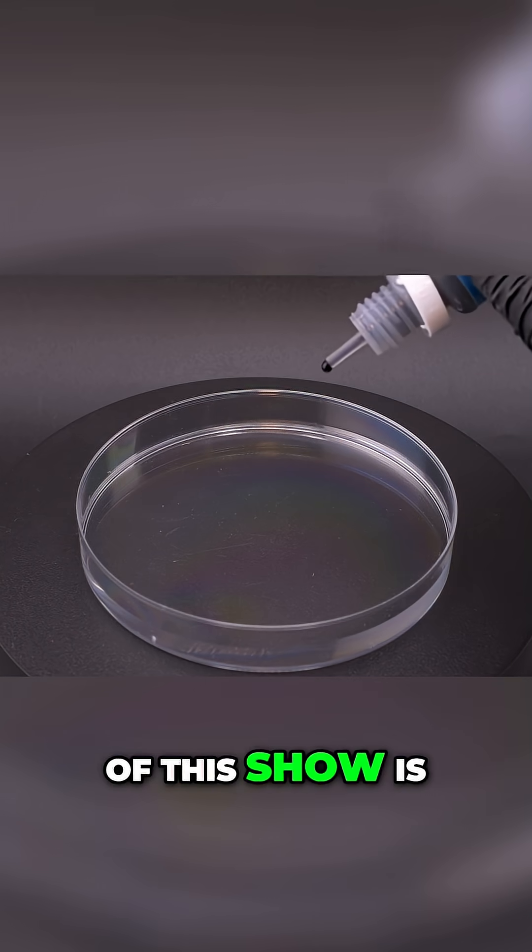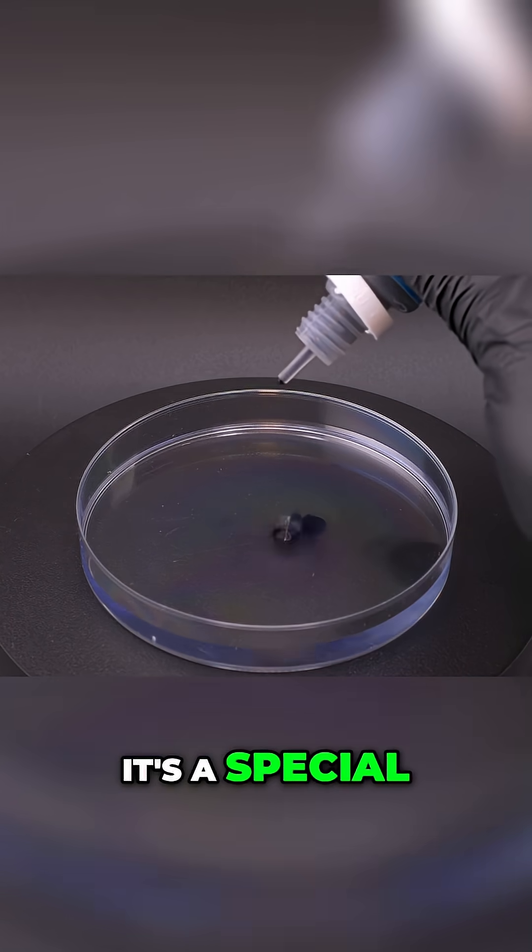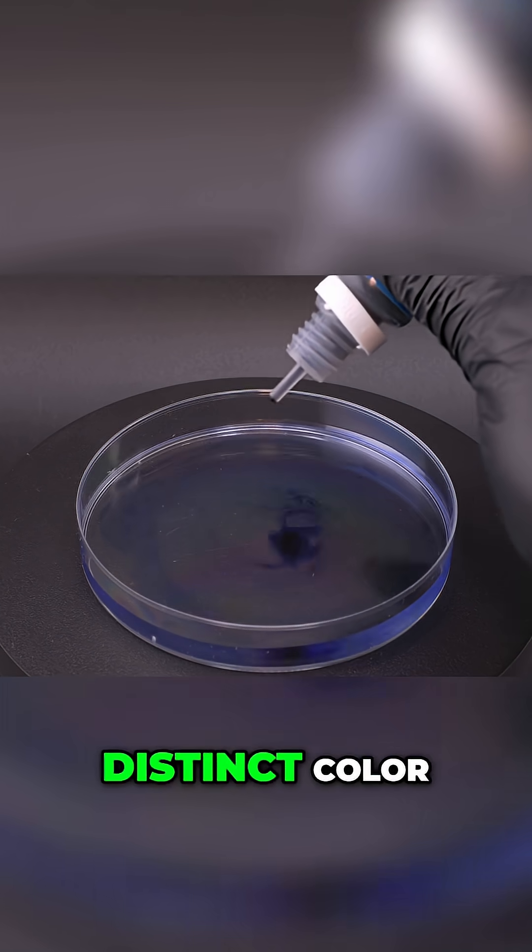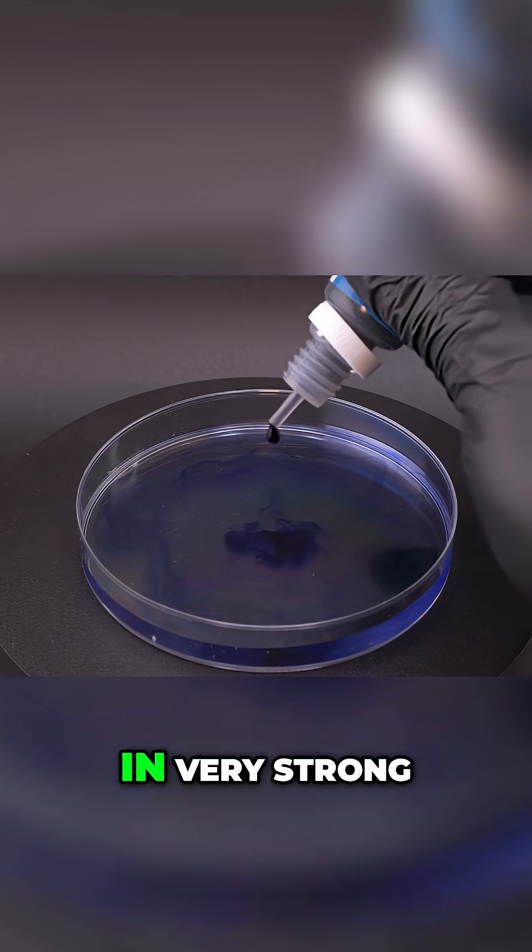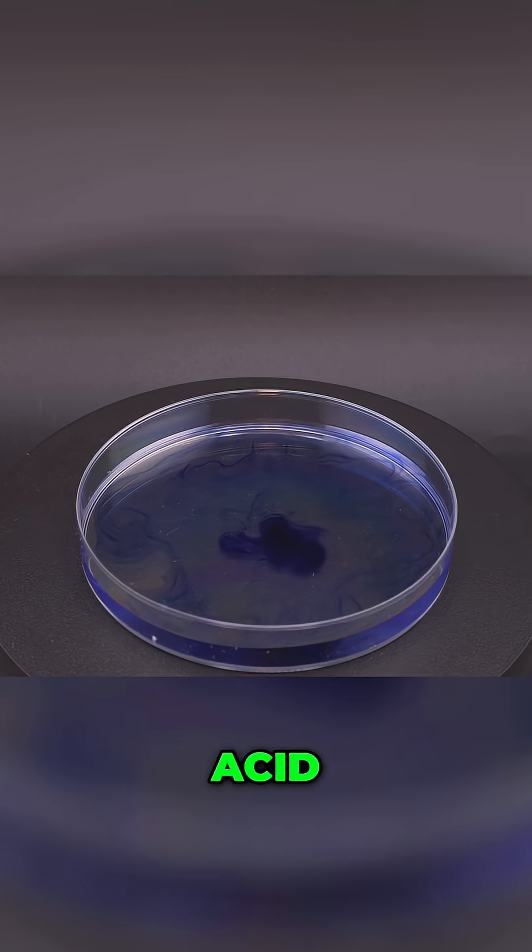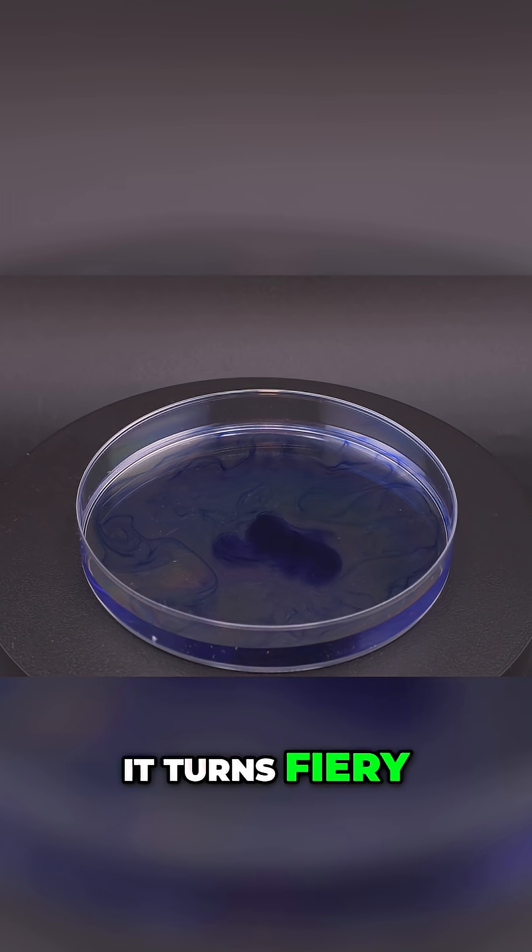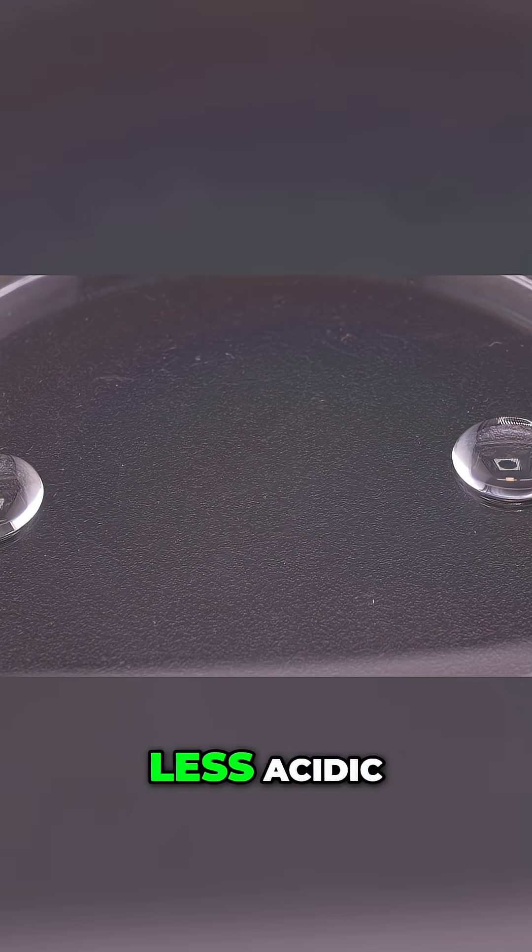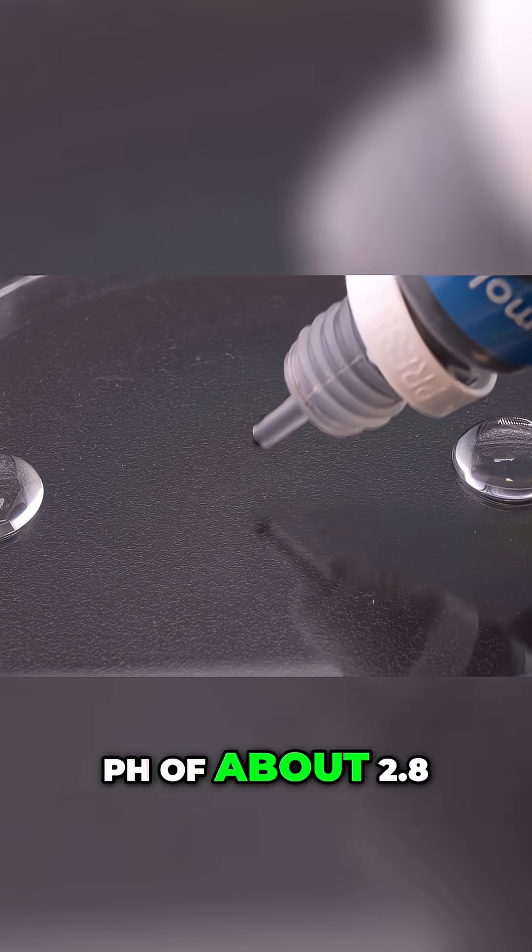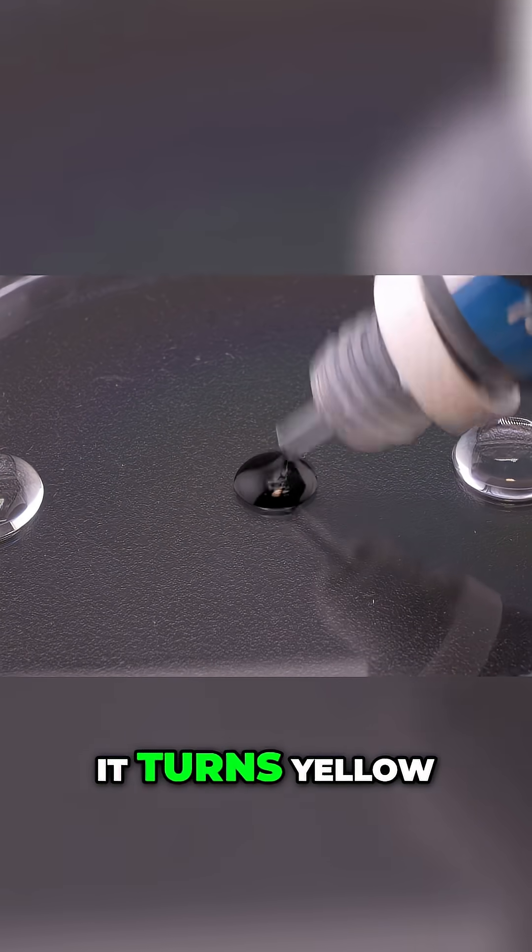But the real star of this show is thymol blue. It's a special indicator because it has two distinct color changes. In very strong acid, with a pH below about 2, it turns fiery red. As the solution gets less acidic from the pH of about 2.8 to 8, it turns yellow.